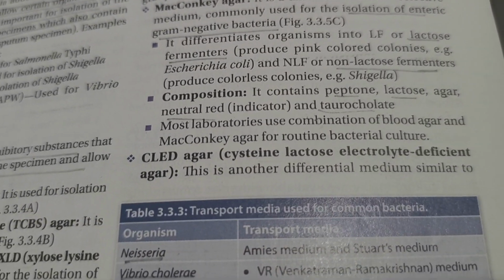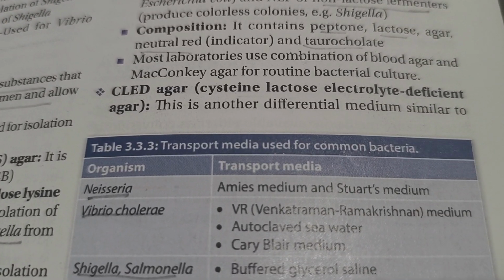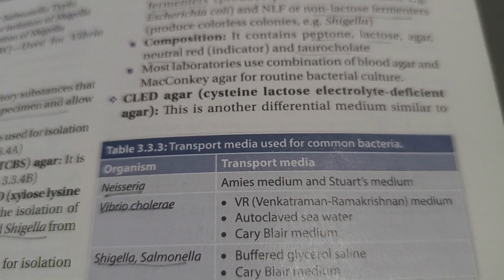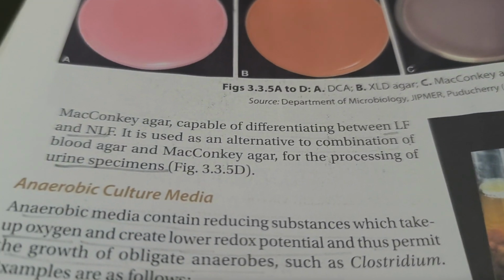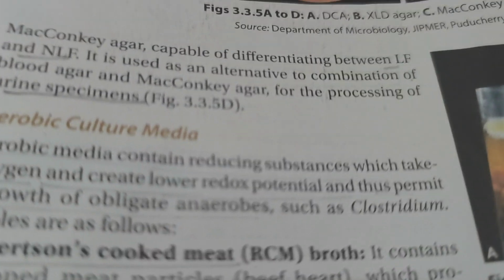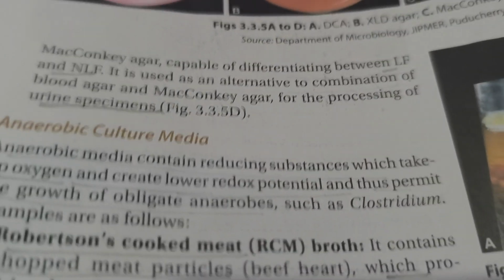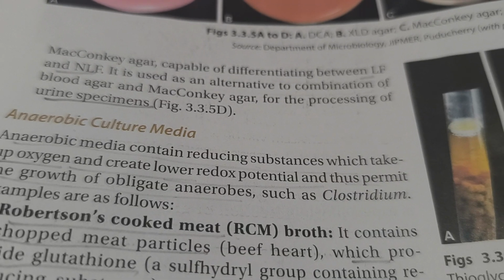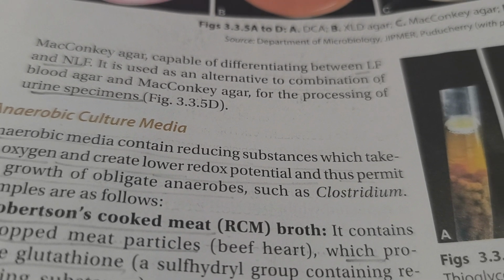Now let's see CLED agar. Cysteine lactose electrolyte deficient agar. Another differential media which is similar to MacConkey agar and is capable of differentiating between lactose fermenters and non-lactose fermenters and is used as an alternative to the combination of blood agar and MacConkey agar for the processing of urine specimens.